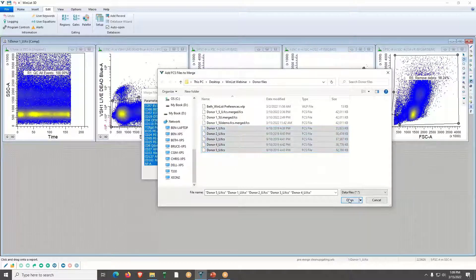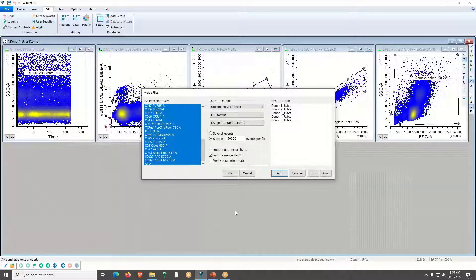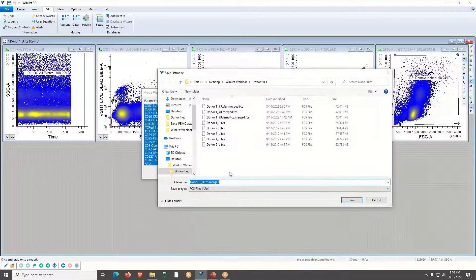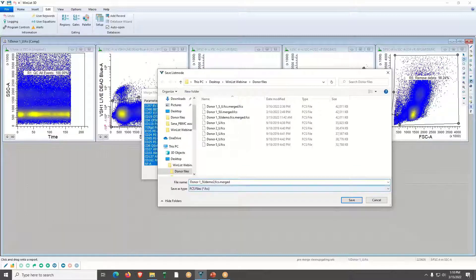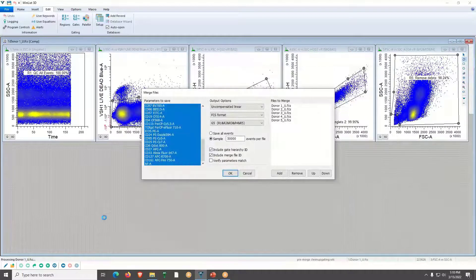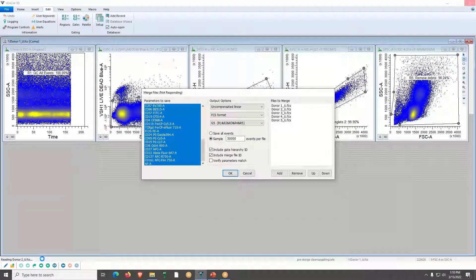I have Donor 1 through 5 — I'll click Open. Then click OK, and I have the option to name my merged file. WinList will start the name with the name of the first file. I'll add a demo label and click Save. You'll see status messages in the lower left as it goes through and reads each data file.